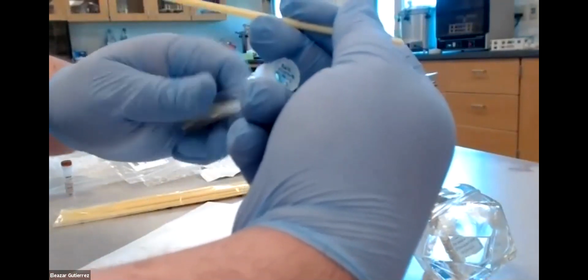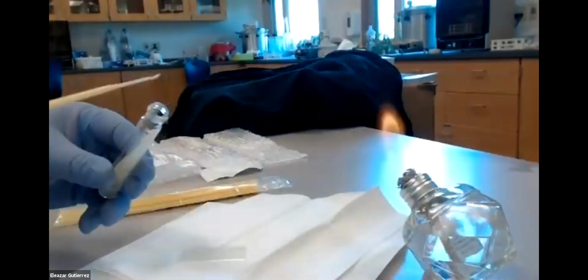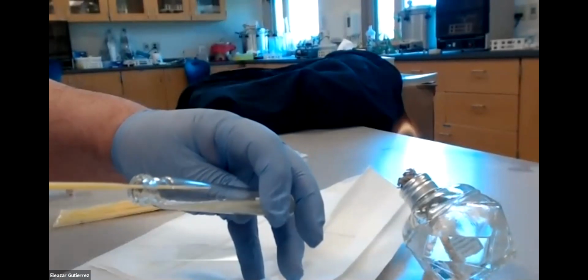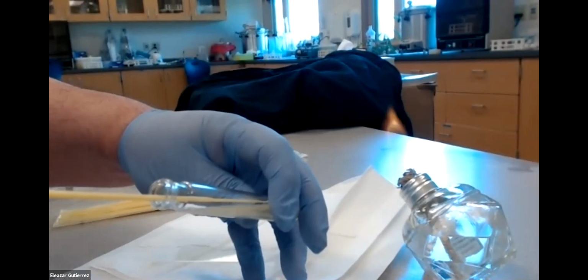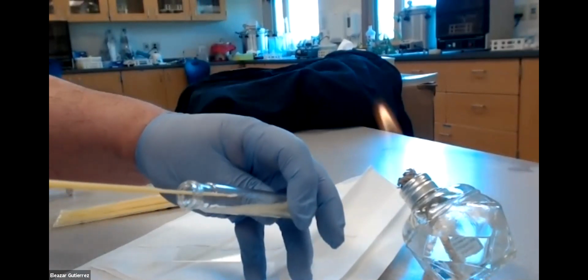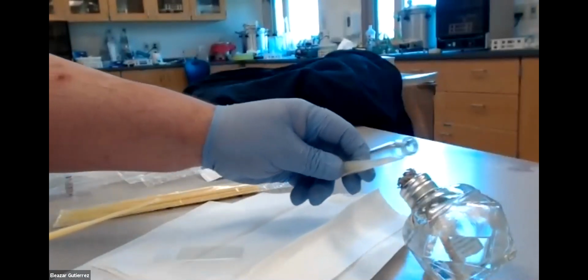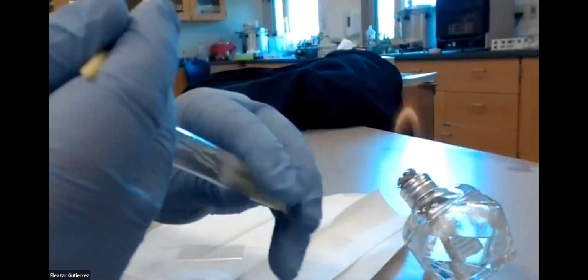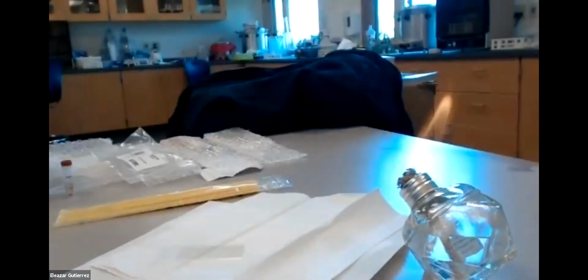open it. I'm going to flame it 2 to 3 times. 1, 2, 3. And then I'm going to stick my loop in there. And I'm getting some of the broth at the bottom. That way I know I'm getting some E. coli. It's nice and cloudy. That looks really good. I'm going to flame it. 1, 2, 3. And then I'm going to cap it again. There it is capped.